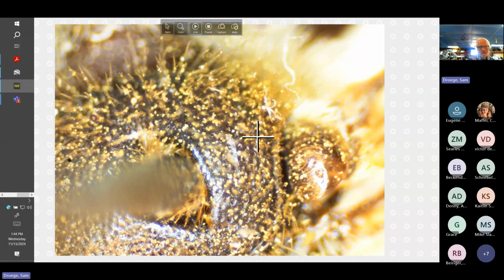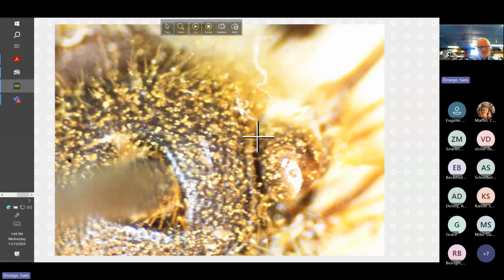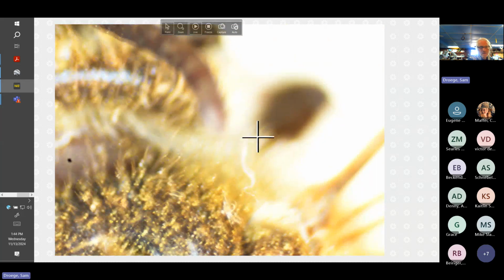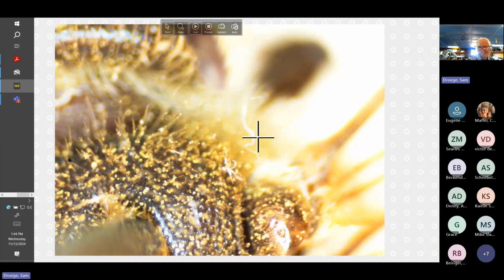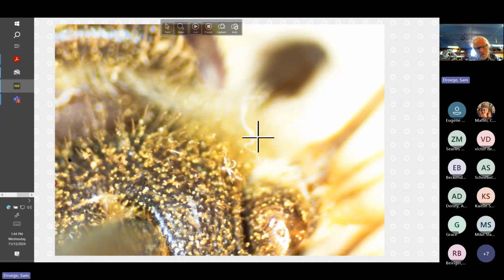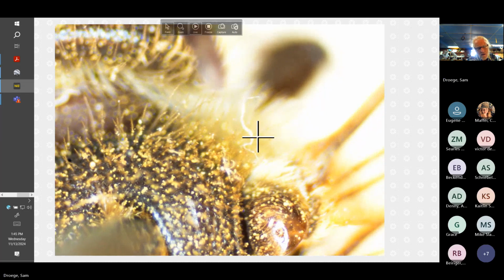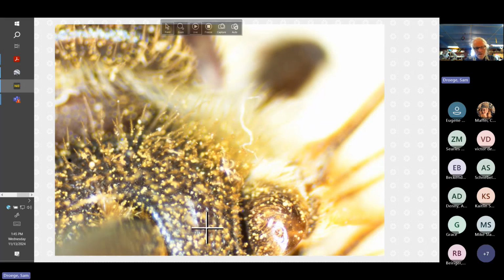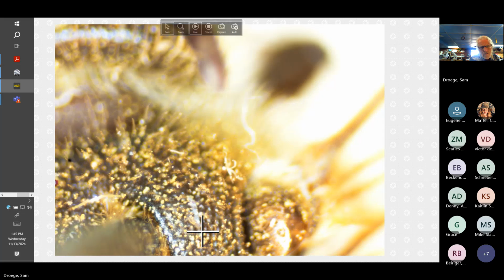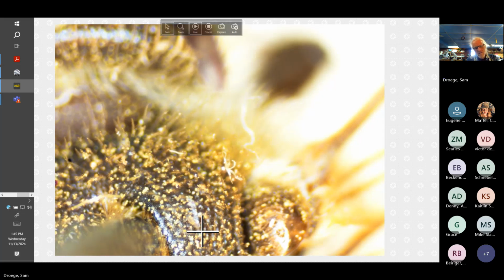So we can see the pits better here. You have a darn big pin right in the middle of everything. So I'm going to try and get things to the side. Get things in focus. It's a little bit hard to see. I do see some gaps though. But mostly, I think any particular pit has another pit that it is touching.